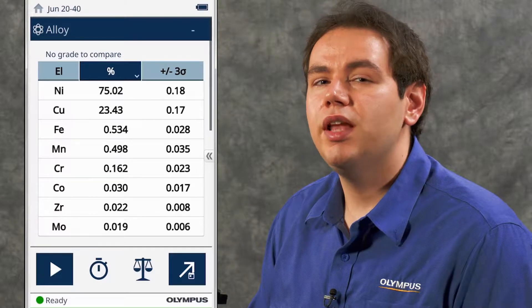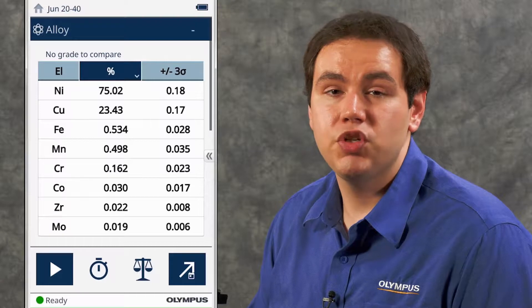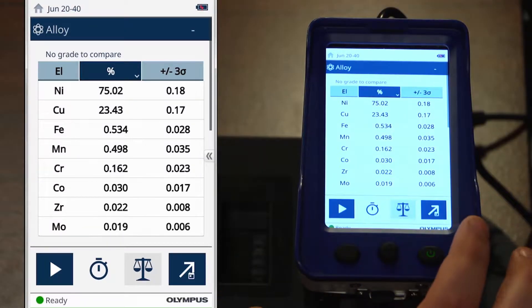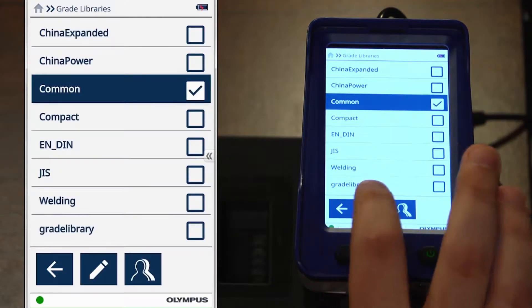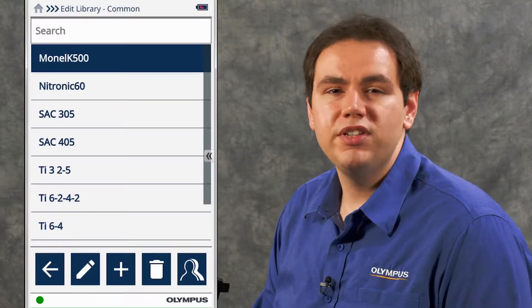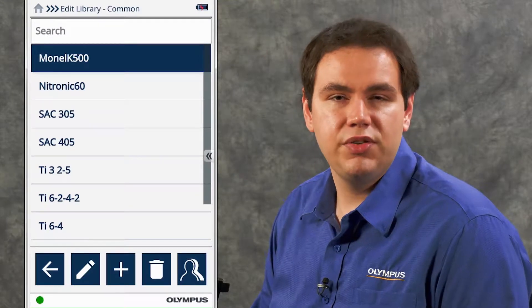Although it's far less common, the sample not being included in the grade library can also cause no match to occur. To check if this is the case, open the grade match icon, scroll down to the libraries, select the library, and open the list. We can see here that Monel K500 is indeed included in our active library. So we've ruled out contamination, and our sample is in the active library.